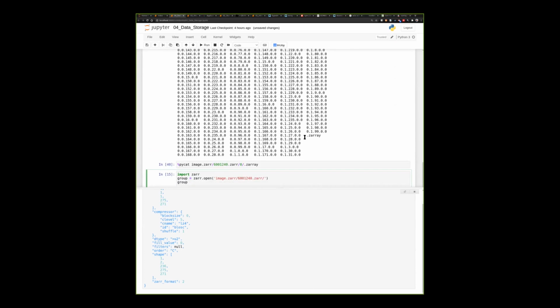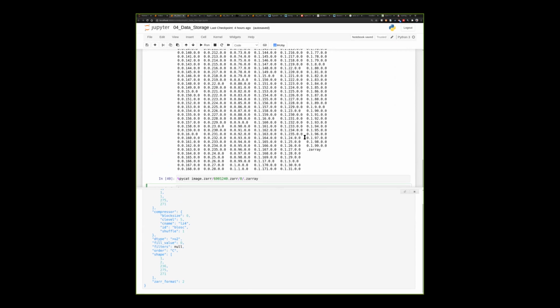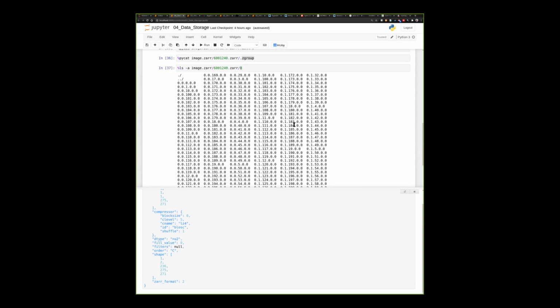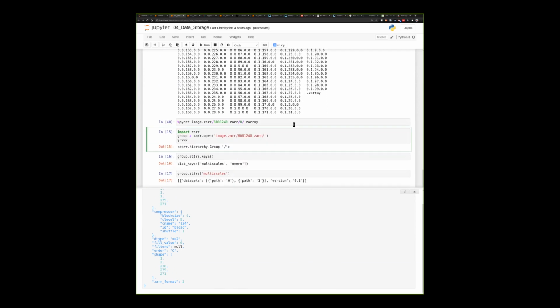It also helps the performance when you're transferring from file system to file system, as opposed to object cloud store to cloud store, because when there are lots and lots of these small files, some file systems are challenged by that performance-wise.